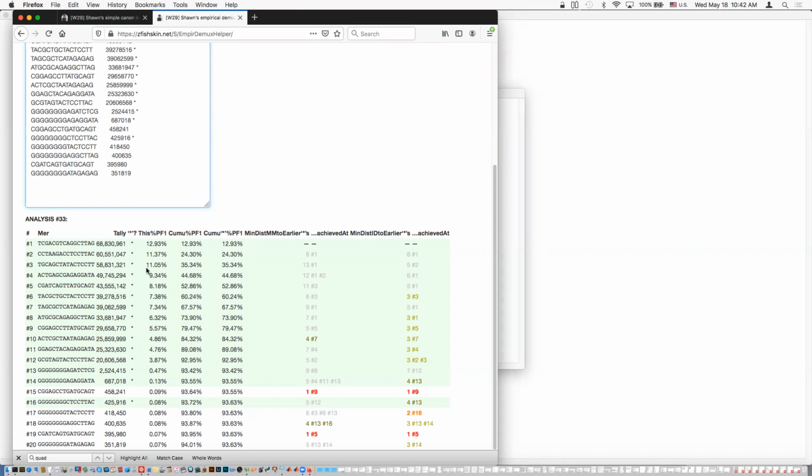It certainly looks like, let me put it this way, there is no really super high representation pair that we haven't already covered. You have to check and look at these and compare them to our I1 and I2 list. But if you compare these that I've marked to our I1 and I2 list, we've already covered all of the first halves and all the second halves. So the pairs do not discover any high representation thing that we're not already going to cover by having all combinations of our existing I1s and existing I2s.